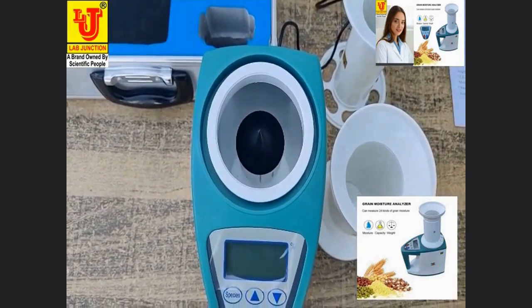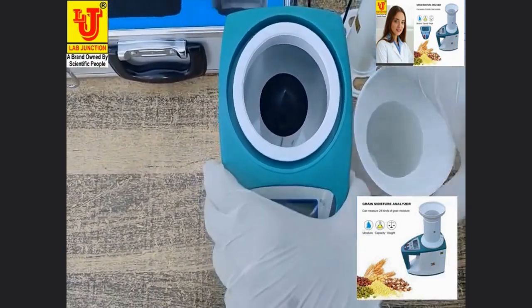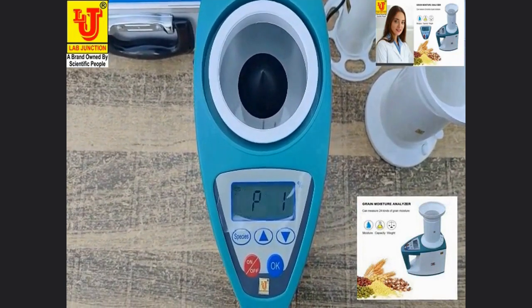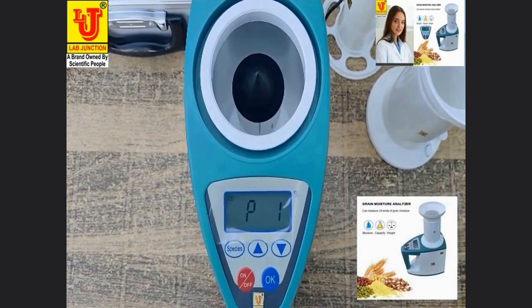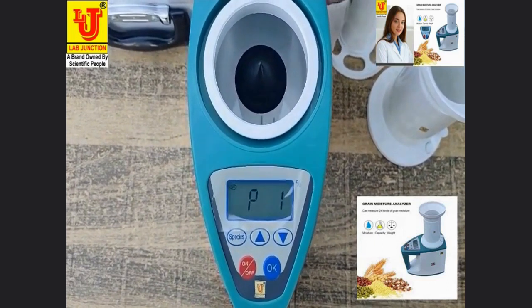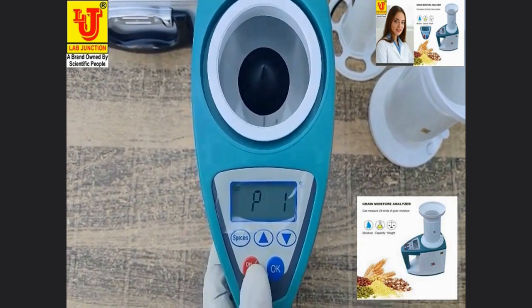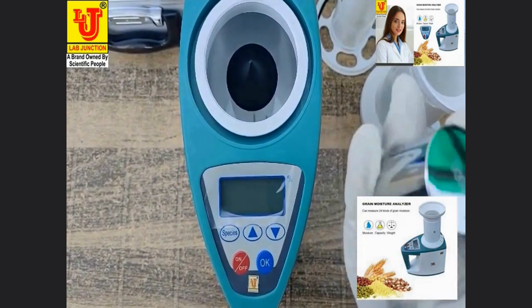I am operating this now — switching on. The display arms. This directly starts and is ready for measuring grains. In many cases it shows error 1, error 2, or error 3. Then you can first switch off this and calibrate the moisture meter again.